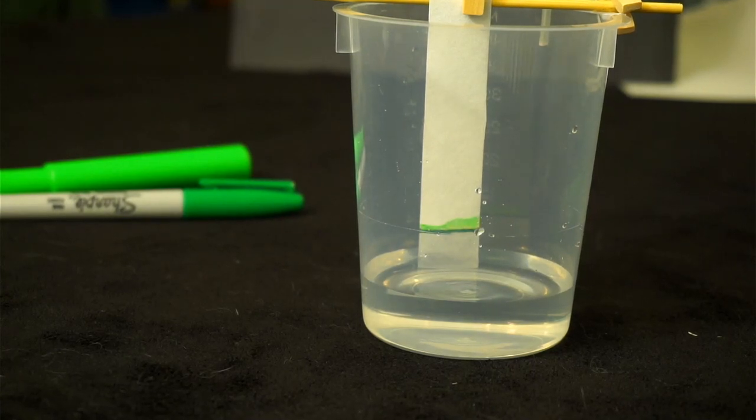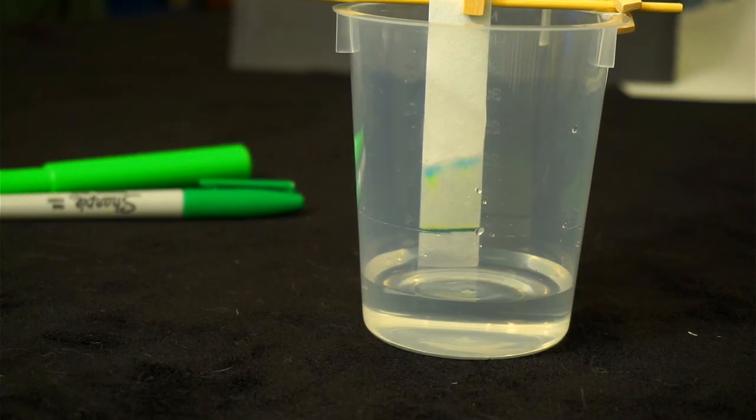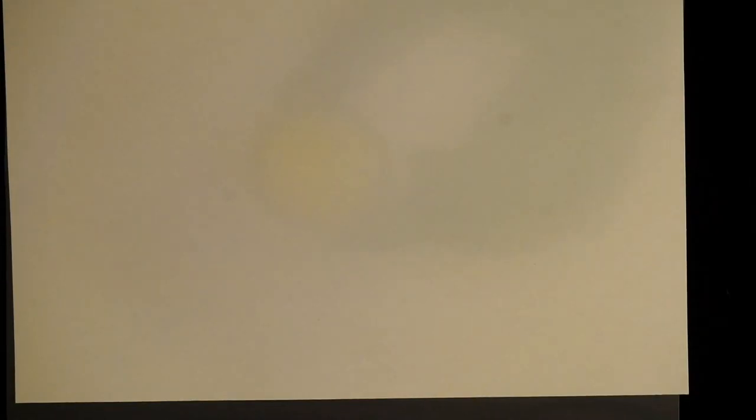I've set up a couple more runs basically the same way. This time, I've got a green sharpie and a green highlighter. And you can see that the green sharpie stays right where I put it, and the highlighter moves much faster. But we can actually do one step better.